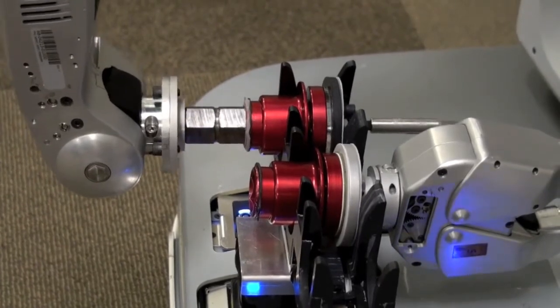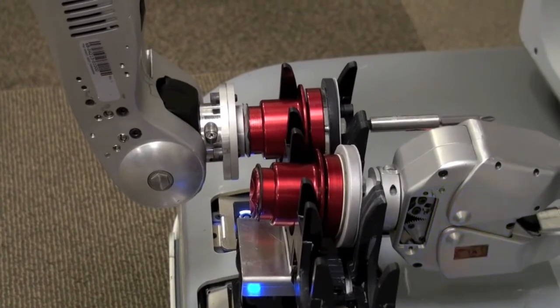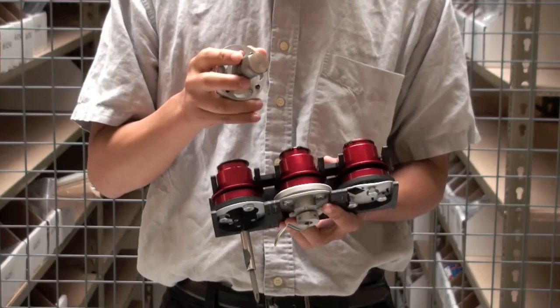When it swaps the end effectors, you want to have not only the mechanical connection but the electrical connection, so the robot can communicate with the gripper to open and close, or whatever.